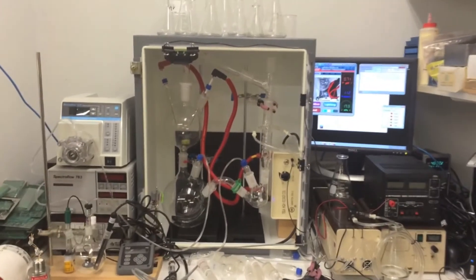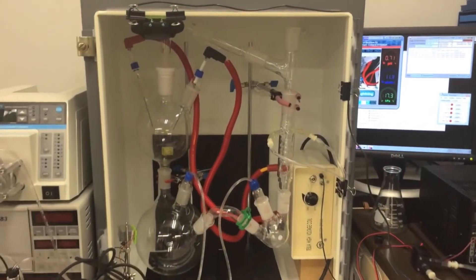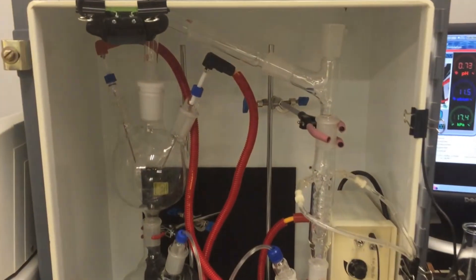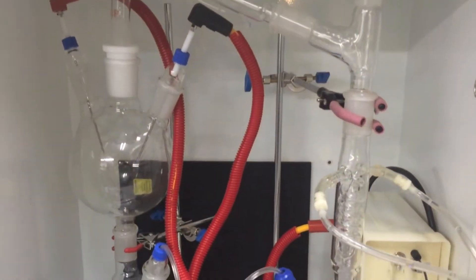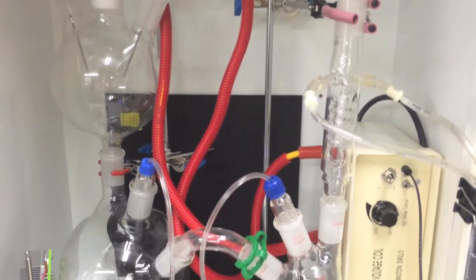Our experiment will consist of some flasks and tubes. We are using methane, carbon dioxide, ammonia, nitrogen, and water vapor to create our very own prehistoric atmosphere.